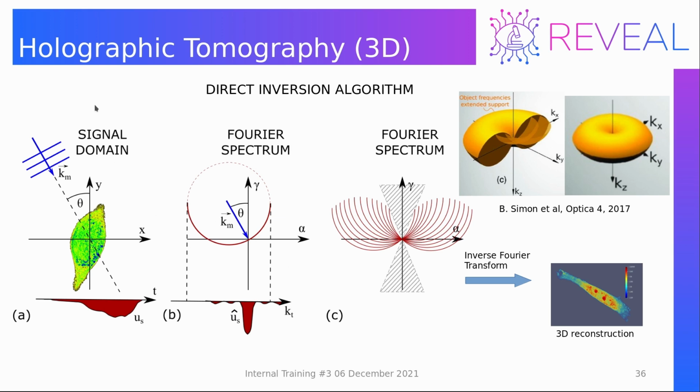After we capture all the projections, you can see that the spectrum will get partially filled according to the picture shown here. However, in this direction, the direction of the optical axis, we have no information. This red information marked here is not present in this direction.